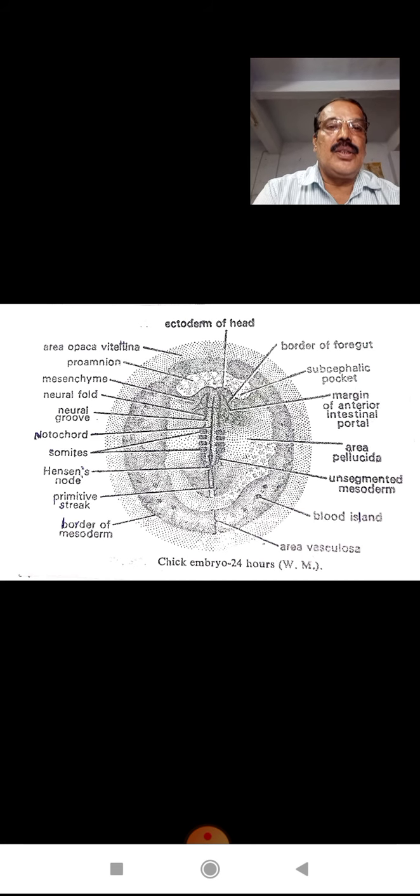This is something about a whole mount of 24 hours chick embryo.